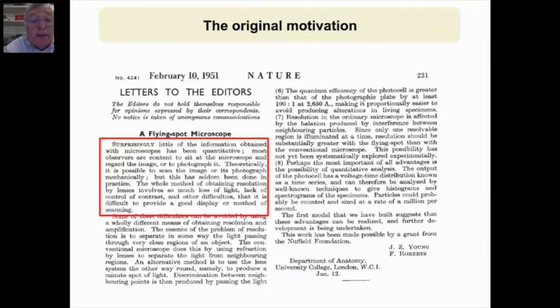They also make the point that by imaging the whole thing in one go, if you like, imaging in parallel, you lose the freedom to tune the resolution, to tune the imaging in a way which you would be able to do if you were to image sequentially, i.e. in a scanning approach.